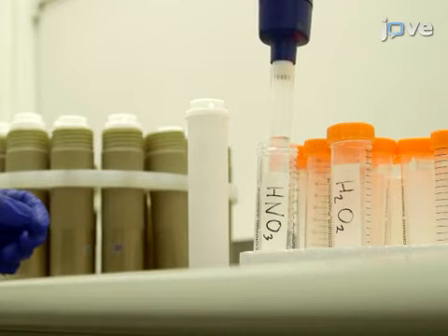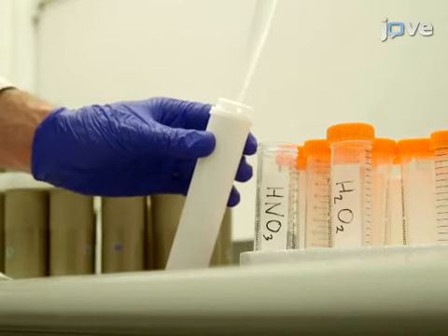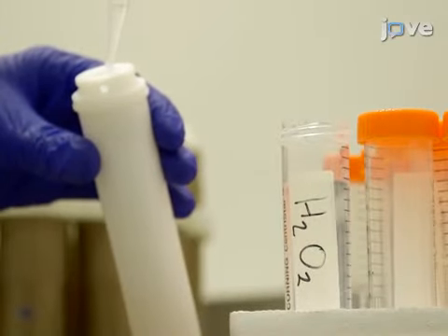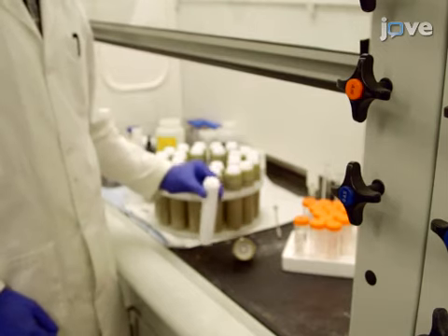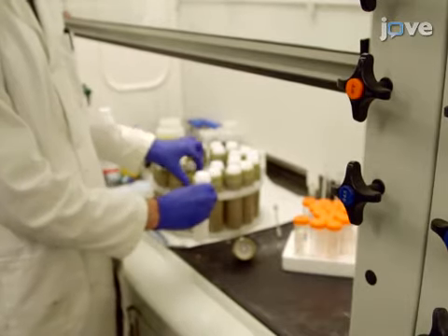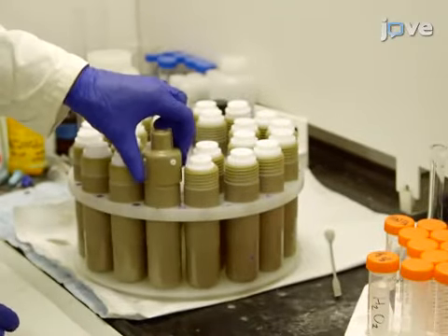Next, to each vial, add 7 milliliters of concentrated trace metal grade nitric acid and 3 milliliters of hydrogen peroxide. Then, swirl the solution to homogenize before digesting the contents of each vial and analyzing according to the text protocol.